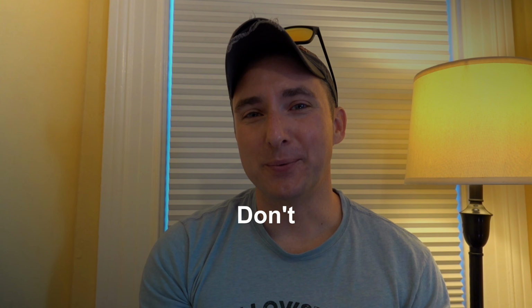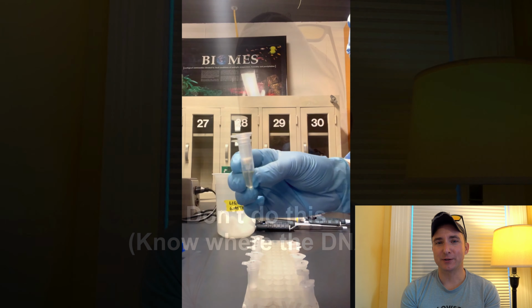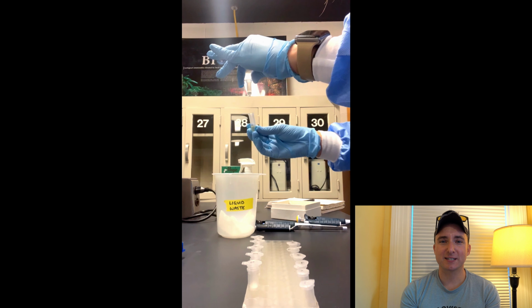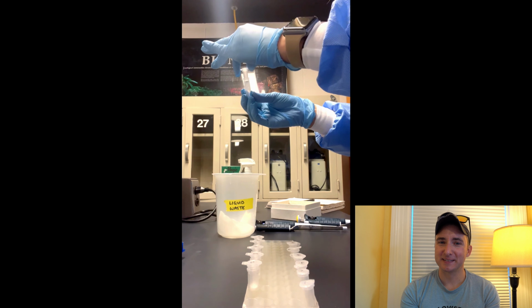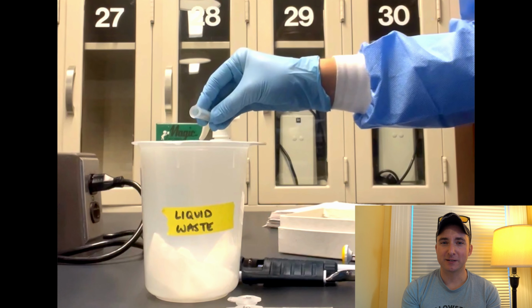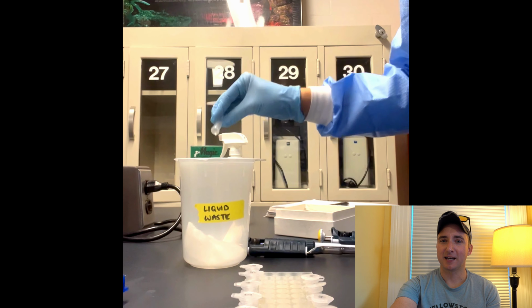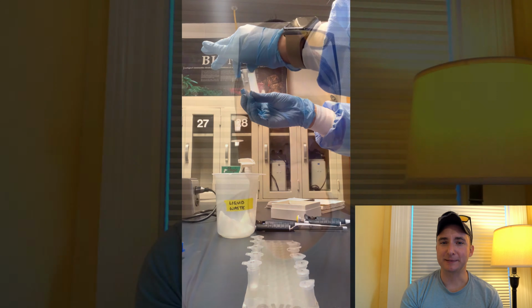One of the most common wrong ways to do this is to forget where your DNA is and discard the DNA instead of the waste flow-through. So gently, carefully, smoothly, you separate the filter from the liquid and you can just dump it. You don't have to get that bottom tube totally dry. You don't have to use a pipette to carefully suck up all of that liquid and expel it. You just have to have a beaker or flask for waste and gently empty it. Just let the volume flow out and replace the filter.